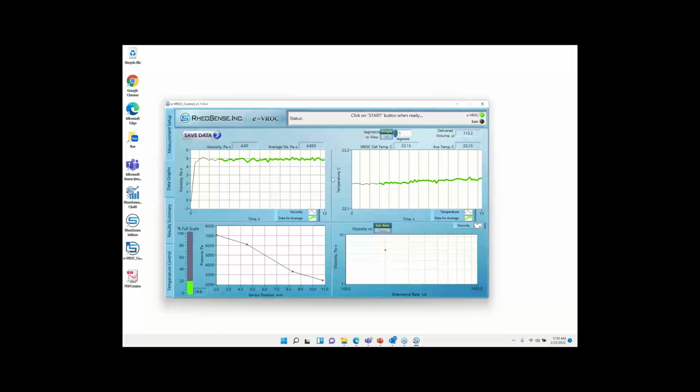So in terms of secondary flows, I would do two things to keep an eye on them. One is look at the pressure drop between sensors 1 and 2 and 3 and 4. In the absence of secondary flows, you can use these to calculate the steady shear viscosity in that uniform zone of the flow channel. If those values are nearly equivalent, that's one indication that you don't have any secondary flows that might be disrupting those pressure sensors near the entry and exit point.